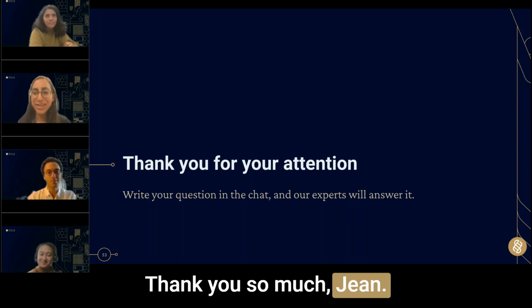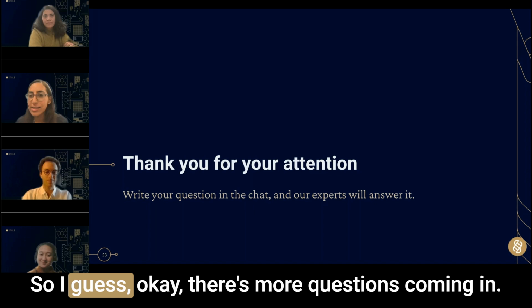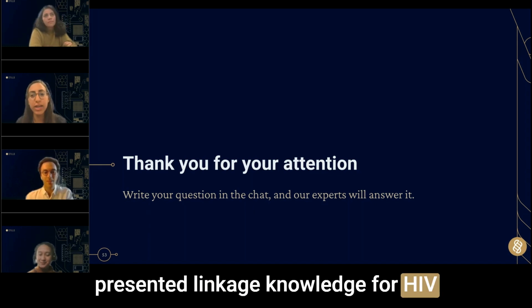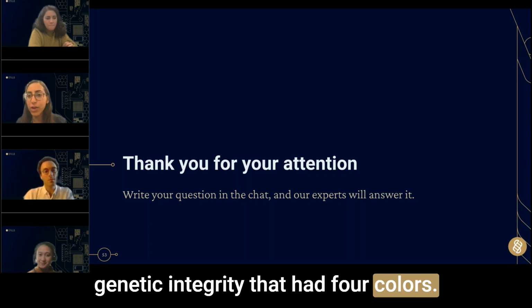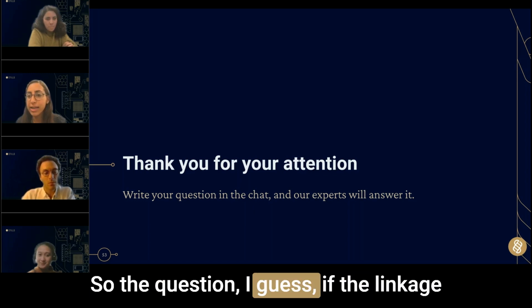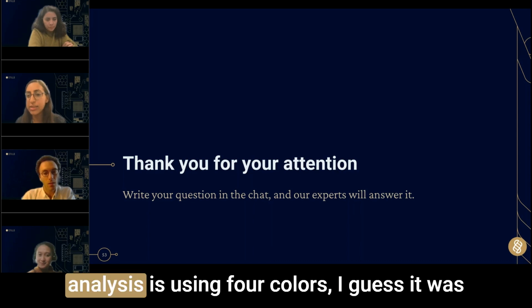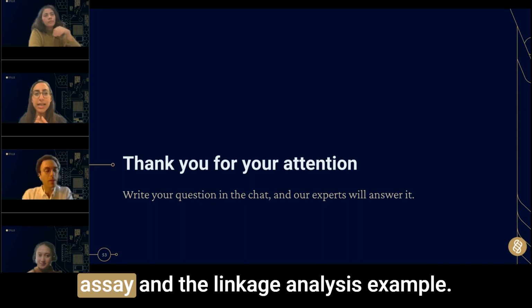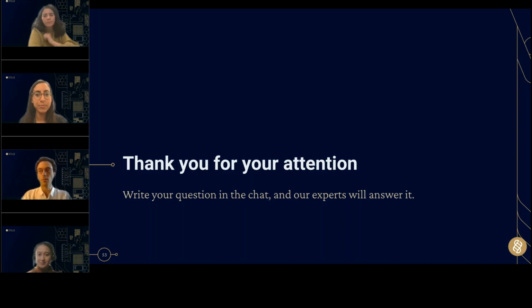Thank you so much, Jean. So I guess, okay, there's more questions coming in. There's one question about the presented linkage analysis for HIV genetic integrity that had 4 colors. So the question, I guess, is whether the linkage analysis is using 4 colors. I guess it was a quick confusion between the kanamycin assay and the linkage analysis example.